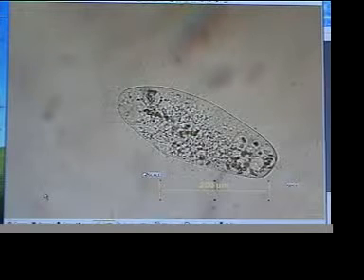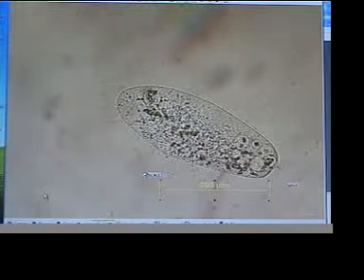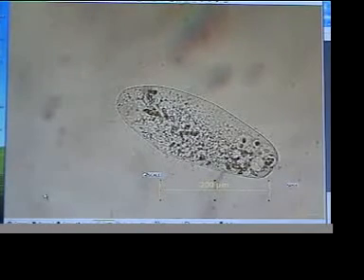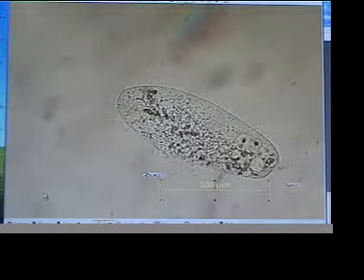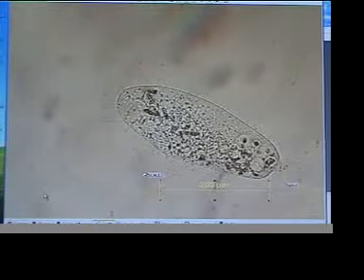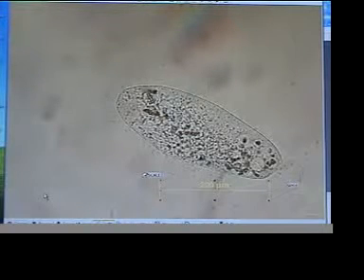That's a nice picture of the devitalized paramecium done with the DIC filter. You can see numerous internal parts are showing up in different colors. Something like Royal Raymond Rife would say, staining with colors. There are no stains being used. This was a living organism, and we're just altering the filters through which the light passes, and we are getting those different colors you're seeing on the screen.